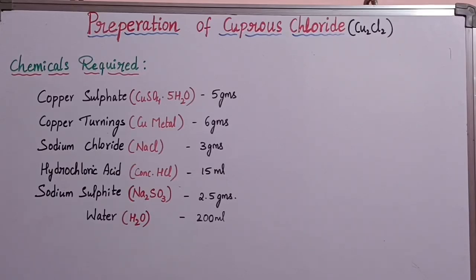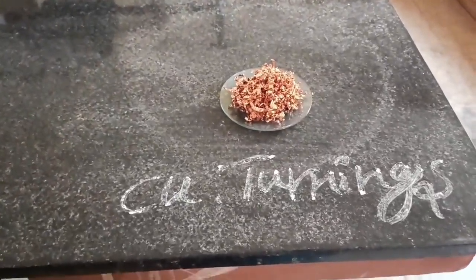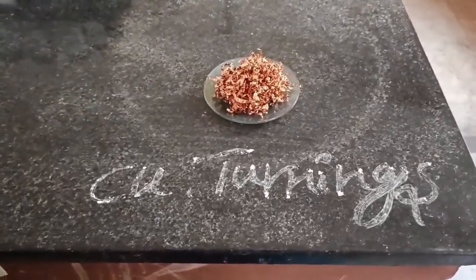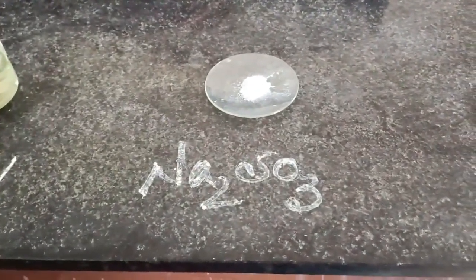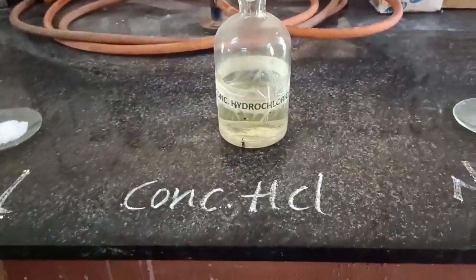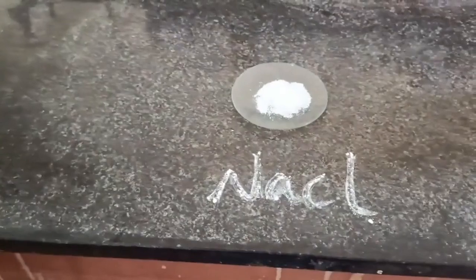Now let us see this preparation method in our laboratory. You can observe all the required chemicals which are weighed using an electrical weighing machine: copper turnings 6 grams, copper sulfate 5 grams, sodium sulfite 2.5 grams, concentrated hydrochloric acid 15 ml, and sodium chloride 3 grams.